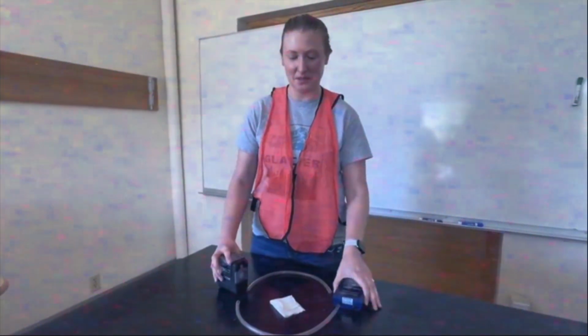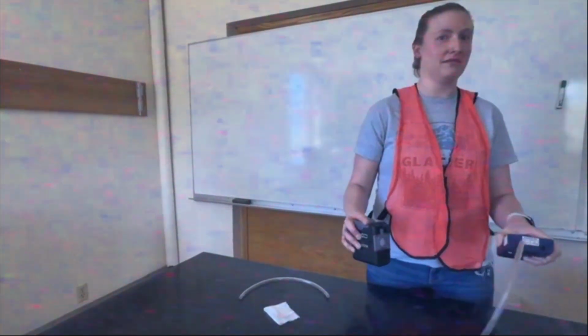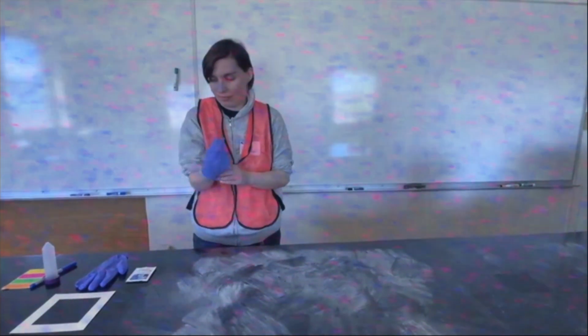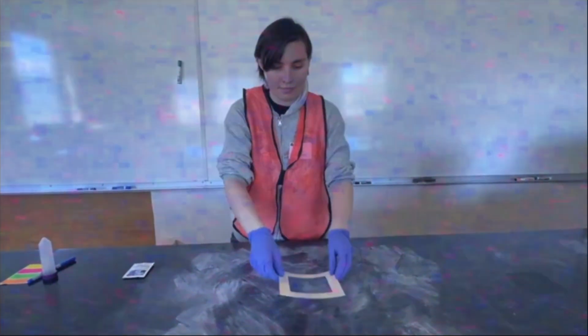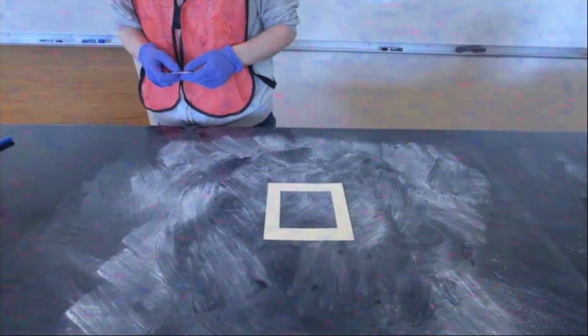The industrial hygienist has realized their error. Observe the retreat. It is both professional and appropriate. The industrial hygienist will now demonstrate the wipe sampling technique. With gloves on, a sampling location has been selected and a template has been placed. The template defines a known sampling area. This area measures 100 square centimeters, a size favored by industrial hygienists worldwide.